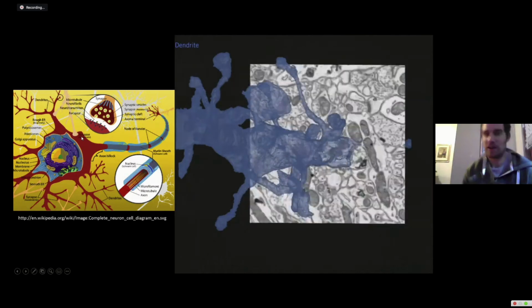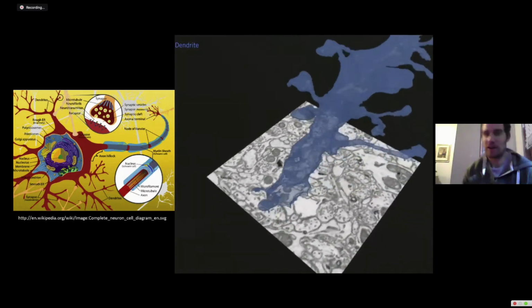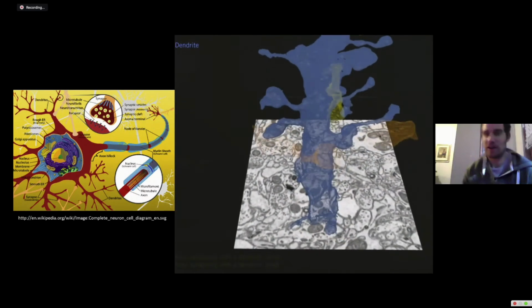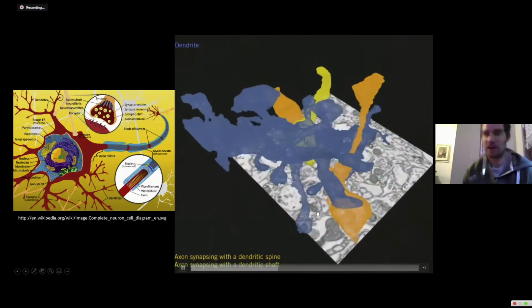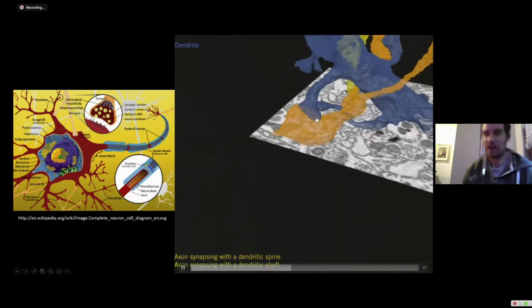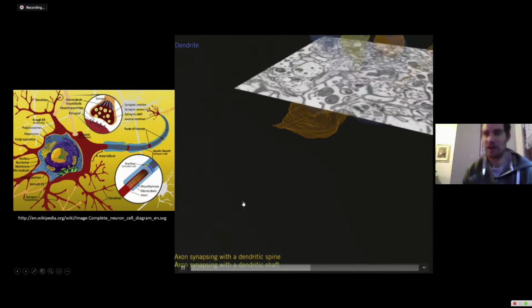Brain cells are organized like trees, where you have branches that receive signal, kind of like how leaves receive light. Similarly, you have these dendritic spines with synapses on dendrites that receive signal in the form of neurotransmitter, kind of how Uri explained earlier. And here you can see that these synapses can happen on dendritic spines, which is what we're looking at in the video right now.